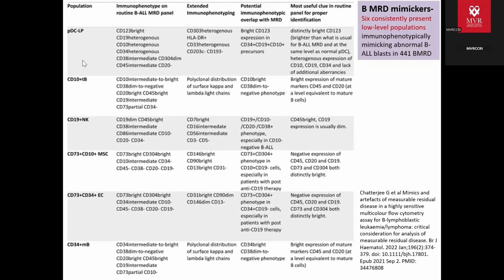So the advantage for flow cytometry. This is a comparison of these 3 tests. We need a fresh sample for flow cytometry. That is another disadvantage. We need to process it as early as possible. However, it is relatively less expensive, with rapid turnaround time, and low labor intensive. Whereas compared to the PCR and deep sequencing, sometimes we need a diagnostic sample in PCR. It's more expensive and the TAT is quite high.